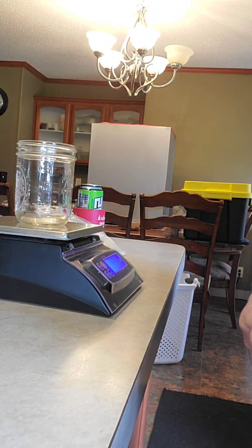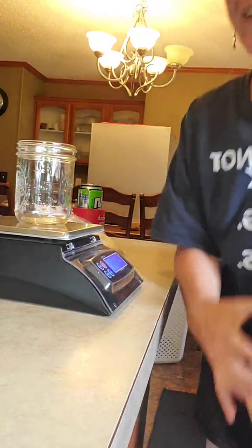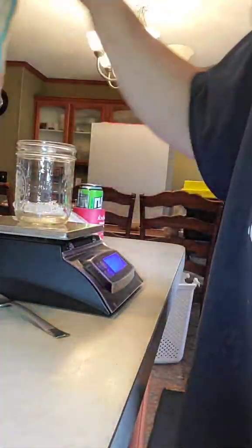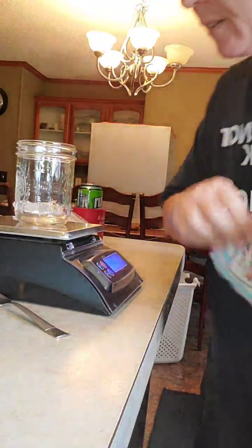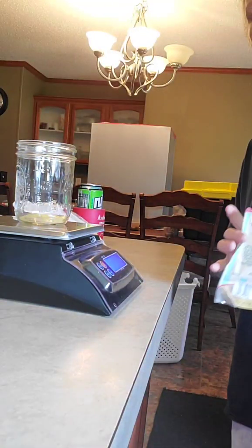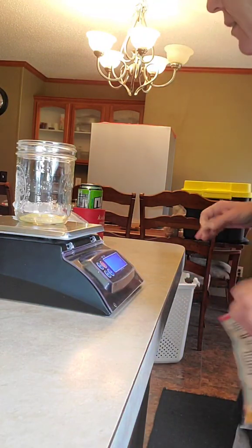All right, so for this recipe, you guys are going to be using 20 grams of agar, 20 grams of your malt extract. We're not even going to talk about the dextrose because you guys aren't going to be using that. 2 grams, 2, not 20, 2 of nutritional yeast. I'm going to weigh these out individually. Boom! Right off the bat, 2 grams. I'll tell you how long I've been doing this.